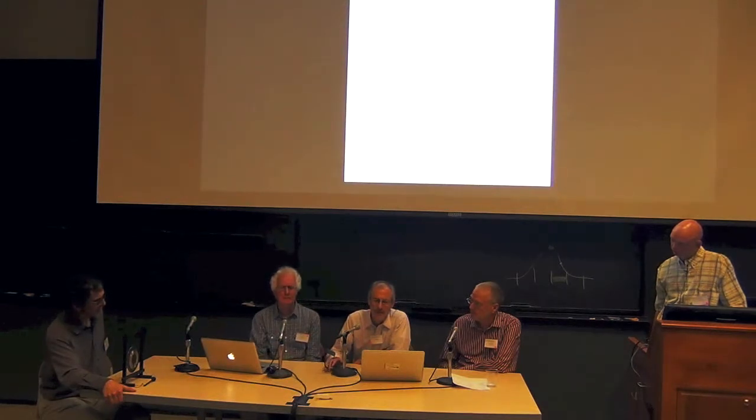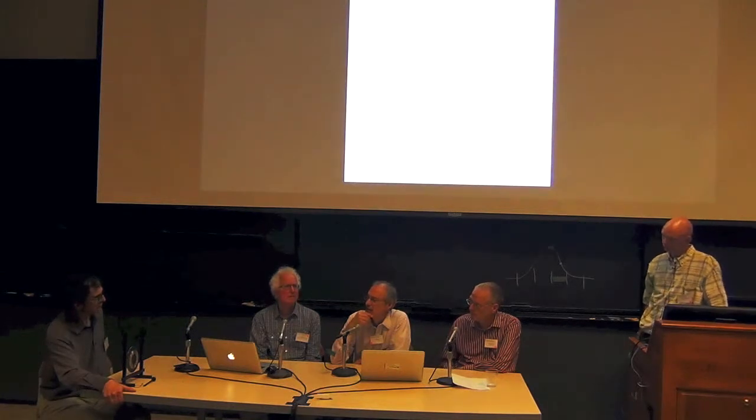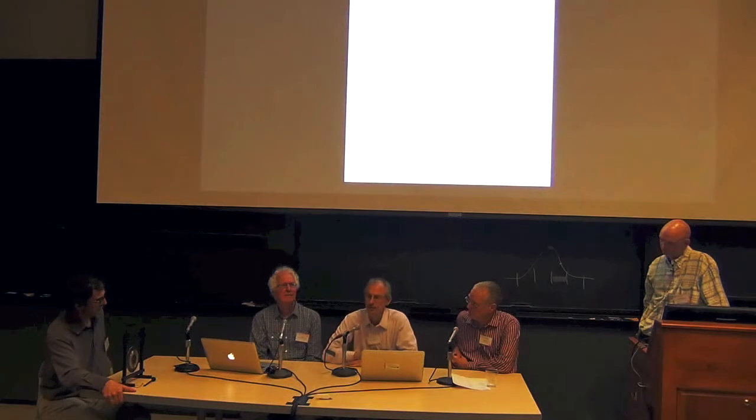So what happened in the table 1 was that the completeness fell off at high resolution, right? So Raj is nodding his head. You know from the geometry of the Ewald sphere in that construction, you can see what's going on. And it turns out that probably at lower resolution, the model in the unit cell was whatever it was, but at higher resolution there was some breakdown in symmetry also.